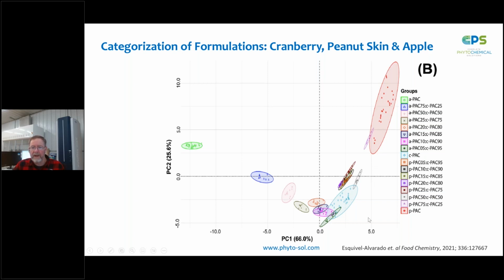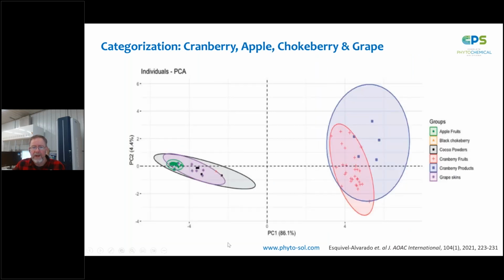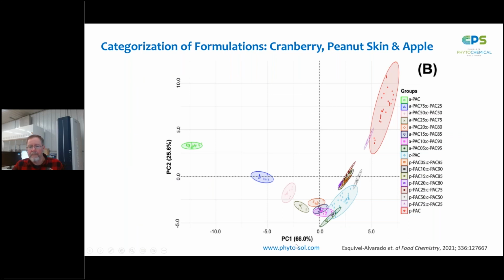And so again, this is an analytic approach to call in very complex data sets from MALDI-TOF mass spectrometry into statistical programs, principal component analysis platforms, for the purposes of segregating and categorizing the compounds or botanicals of interest. And in this case, these two principal components explain over 90% of the difference between these 1, 2, 3, 4, 5, 6 groups. And in this case, the two principal components, again, are very close to 90% of the explanation of what's separating these two classes.